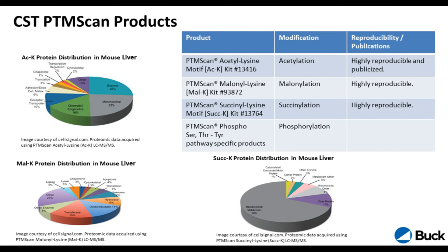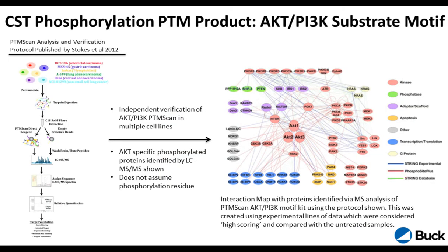One thing that we like about these in particular is that they have a really high enrichment efficiency. We often see between 60 and 80% pure acyl peptides versus other non-modified peptides. So that has worked out quite well for us.